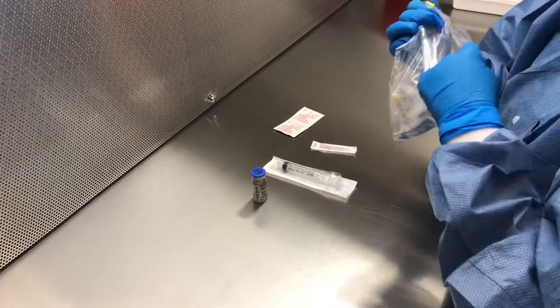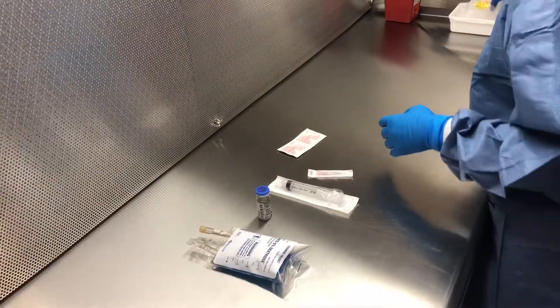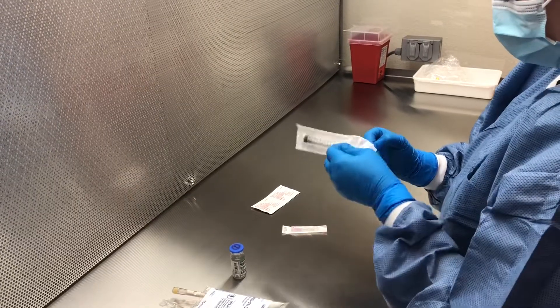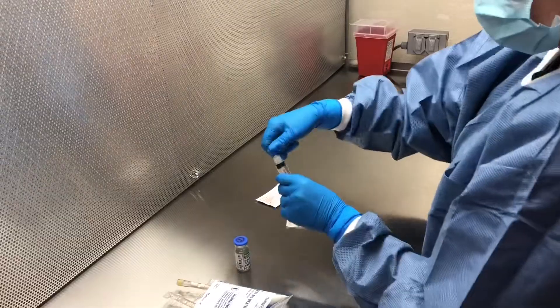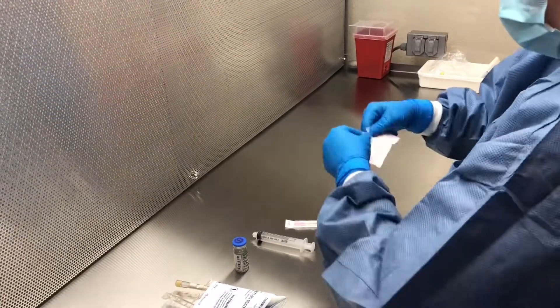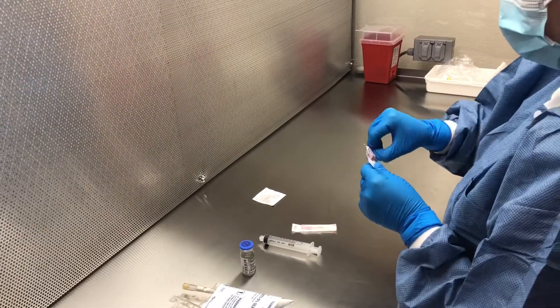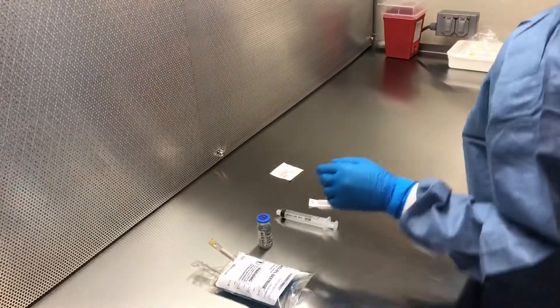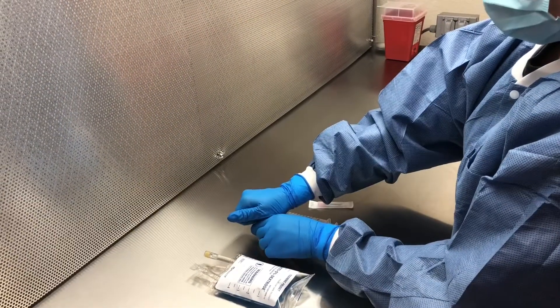As you are unwrapping your products, make sure to put all plastic trash into your trash container so that your space is not cluttered. Before you can begin compounding, make sure to sterilize any ports that you might be adding things to. This includes the stopper for the top of your vial as well as the stopper on the IV bag. Sanitize these by swiping three times in the same direction on each product using a different swab each time.